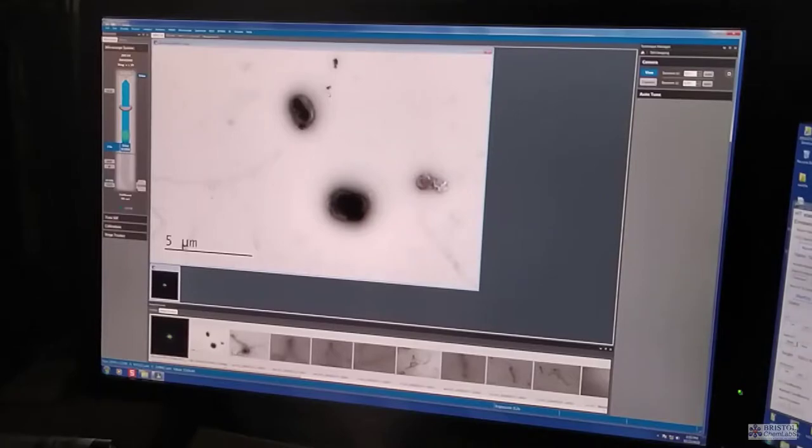For crystalline materials or high atomic weight materials, we have inherently high contrast because they scatter the electron beams sufficiently that they appear dark in the projected image, so we get contrast. Specimens for transmission electron microscopy typically have to be very thin. The support films are amorphous carbon films, so to generate any contrast, we need materials that are generally higher atomic weight. For biological material, it's typically low contrast. To be able to image it effectively, we often have to use indirect methods, like negative staining.